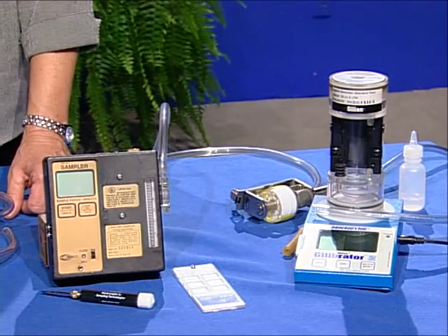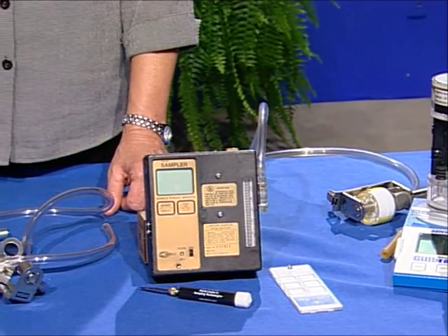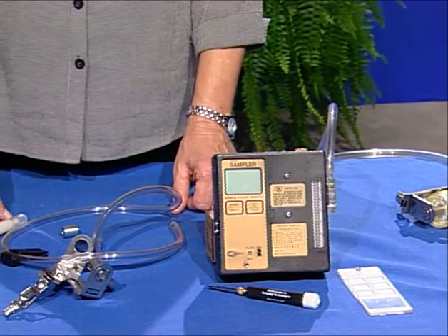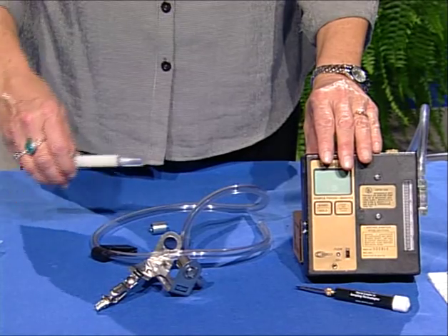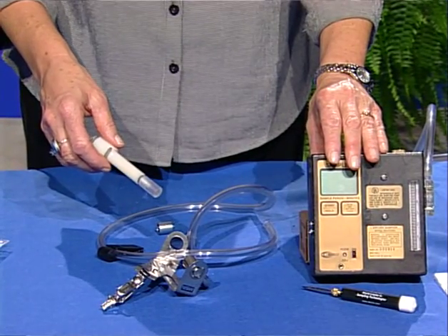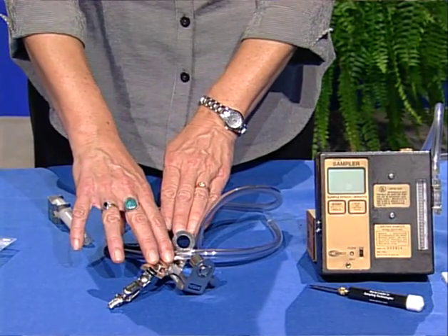The first step in collecting accurate respirable dust samples is to examine the sampling equipment. The sampling train in this case, consisting of a calibrated pump, a 10-millimeter Dorr-Oliver nylon cyclone, tubing, hose, breastplate, and cassette, must be thoroughly examined.